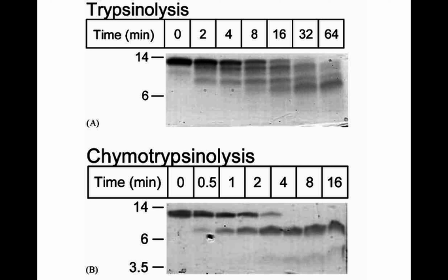But you also have to bear in mind that a lot of the serine proteases only have a shelf life of about 16 hours. That's it. More than that, it wouldn't be active anymore. So that would be it for the first video. Next we will move on to mass spectrometry.